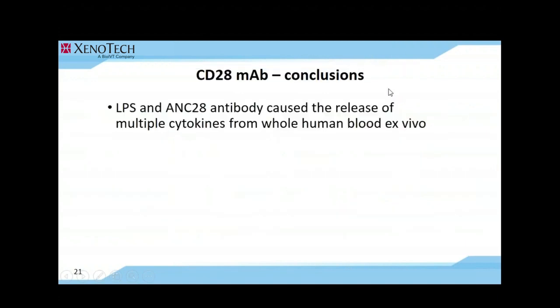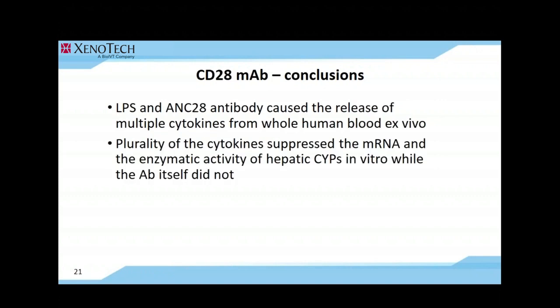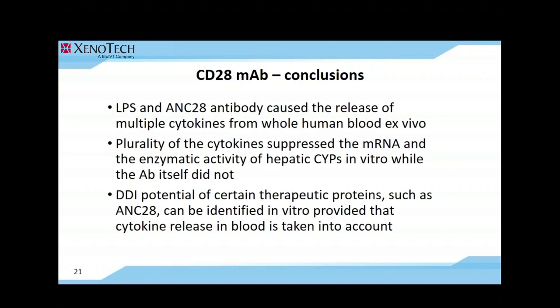CYP3A4. Our conclusions for CD28 case are that LPS and ANC28 antibody cause the release of multiple cytokines from whole blood ex vivo. Plurality of the cytokines suppressed the mRNA and the enzymatic activity of hepatic CYPs in vitro, while the antibody itself did not. Therefore, DDI potential of certain therapeutic proteins, such as ANC28, can be identified in vitro, provided that cytokine release in blood is taken into consideration.